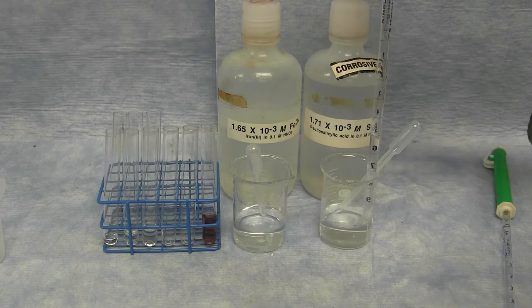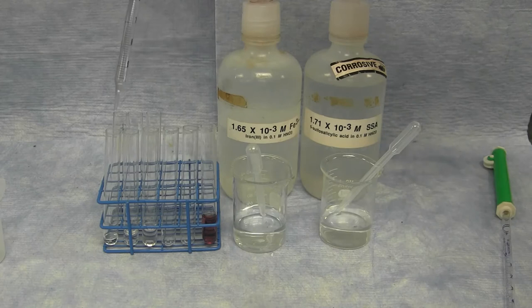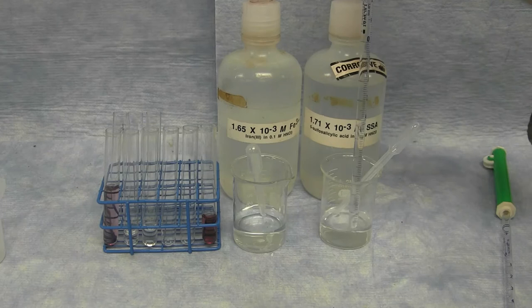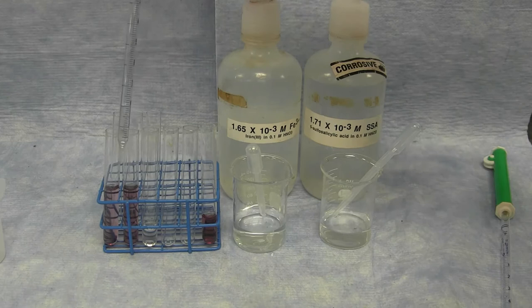Just like with the iron nitrate, I can adjust the volume and bring that up to the 0 mark, and then dispense in the first test tube 9 milliliters for a total of 10 milliliters of solution. I can then draw up more liquid into the pipette. And in the second test tube, dispense only 8 milliliters. And continue on with 7, 6, 5, 4, 3, 2, 1.